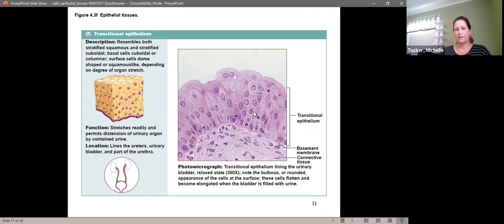And then some other defining characteristics are if you go to the most apical, the most outermost cells, these nuclei are still spherical and they're still relatively evenly spaced. You don't start to really notice hugely differing numbers. I mean, they're a little bit different, but not like in the previous slide. These are still healthy living cells.